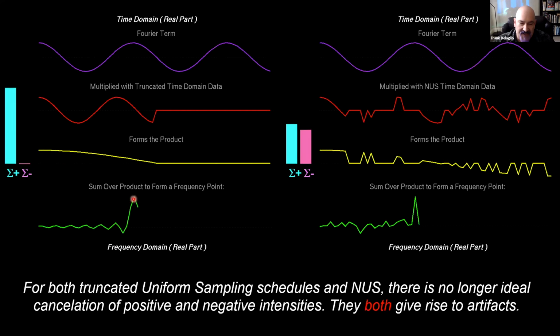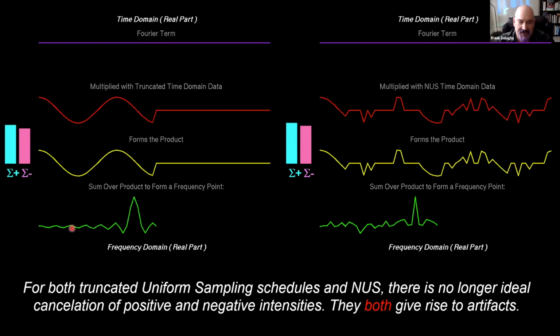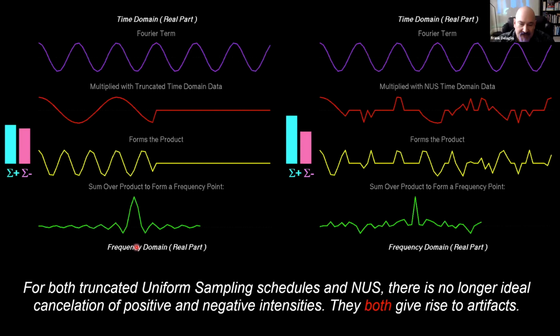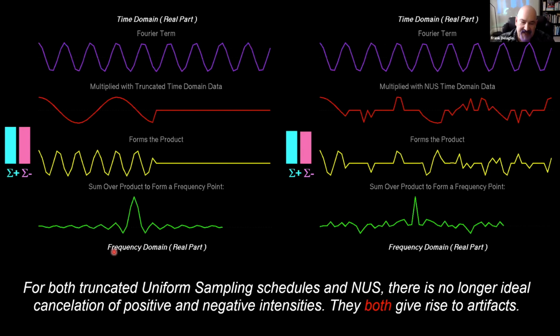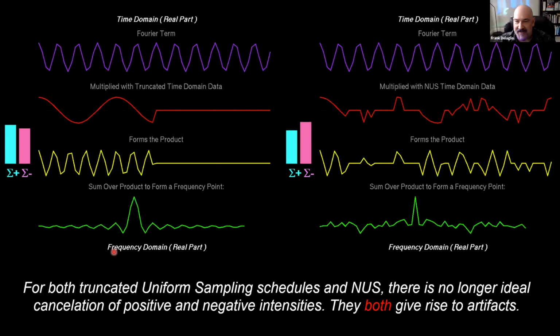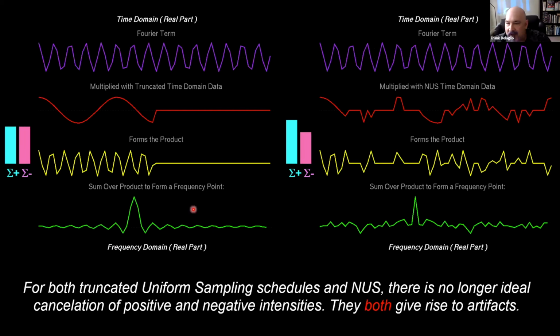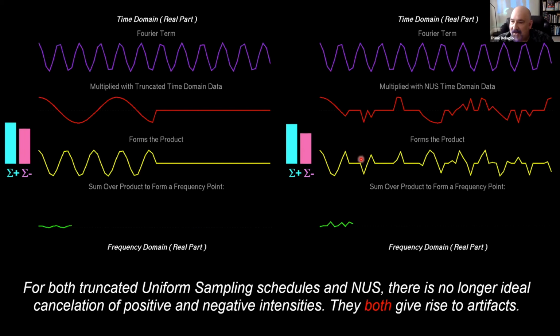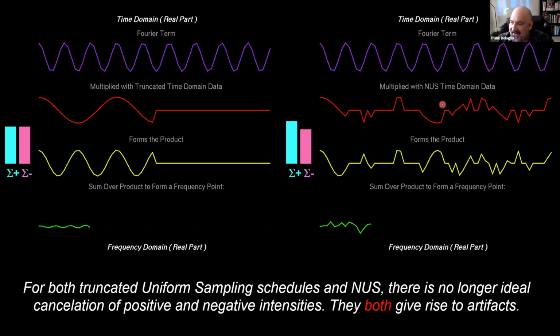And it also gives us these regular truncation wiggles. Okay, so that isn't great, but we live with this. This is what we see every time we process conventional multidimensional data. Now, in the case of non-uniformly sampled data, the data that we get looks like this.